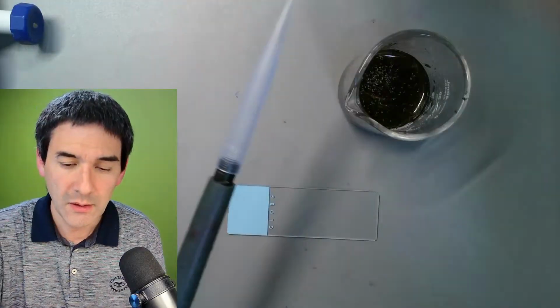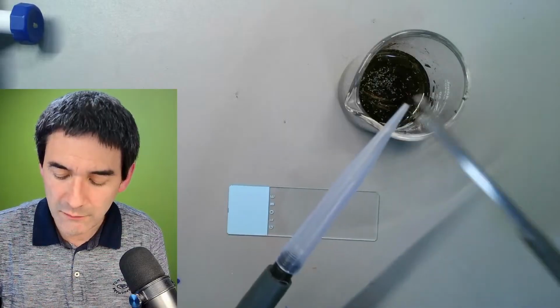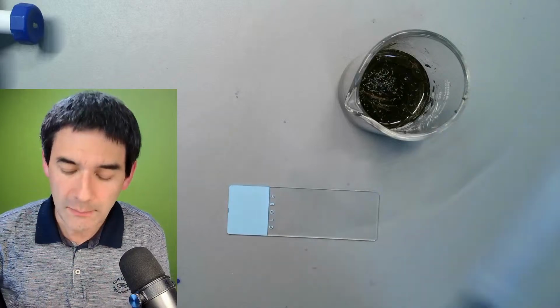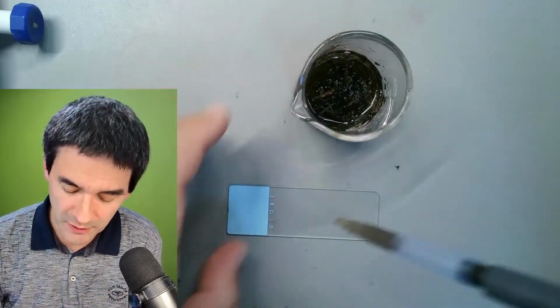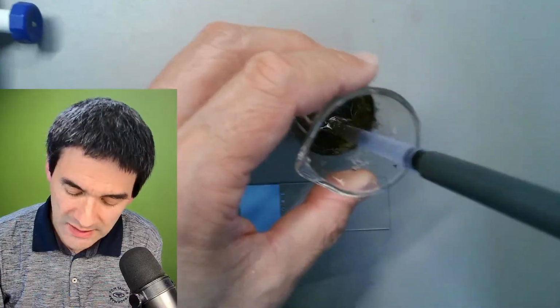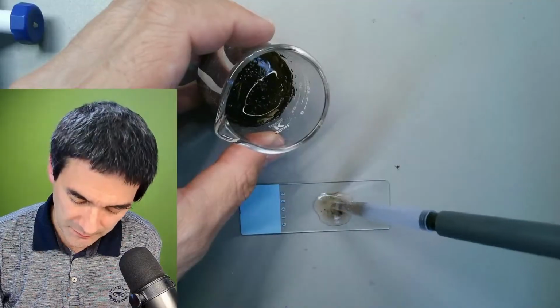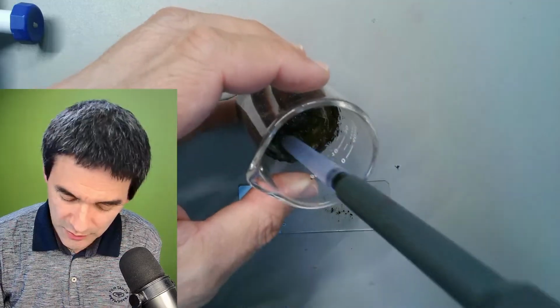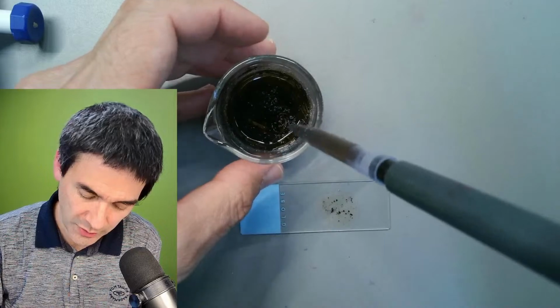I take a pipette. You can also use disposable pipettes. If you use this one, then it might get clogged, so sometimes I simply cut off the tip. And now we of course have the problem that there might be a lot of solid material. No, actually not now, not so much. But I'm going to give you an example here, if let's say there is too much solid material on here. I'm just going to show this to you quickly as a demonstration.